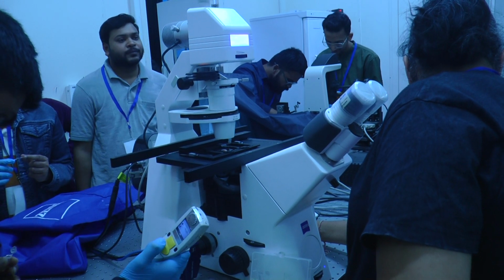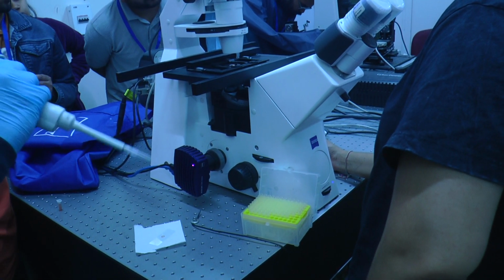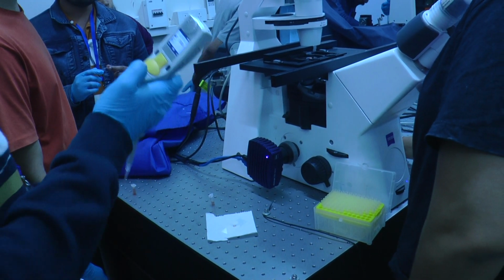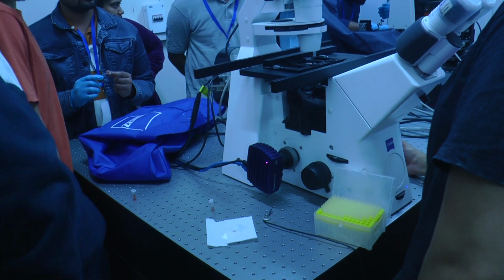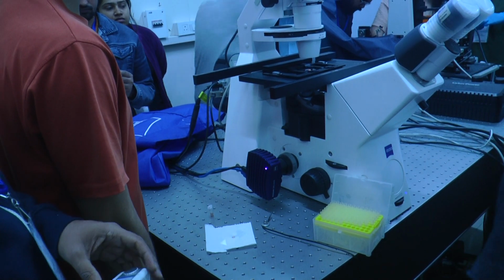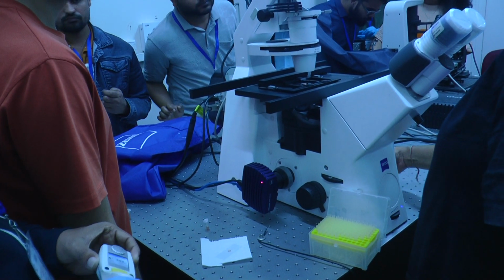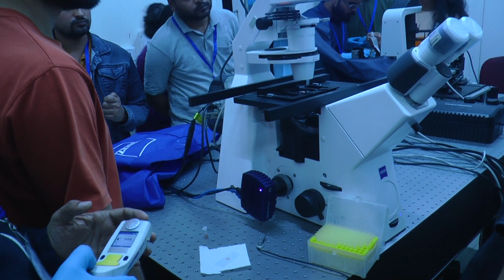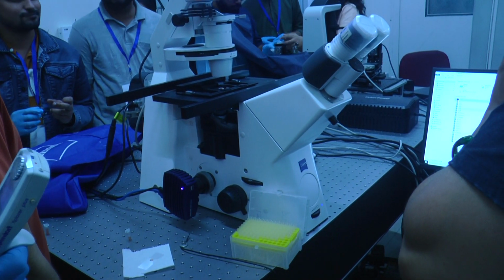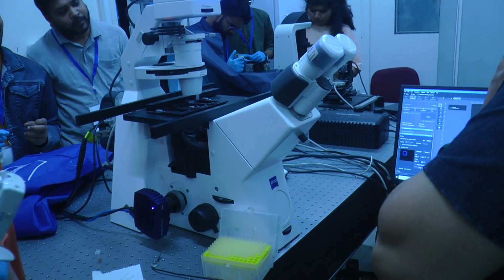Okay. So I've done some kind of damage to the cells. Yeah, this is highly possible because I played with them a number of times. Oh, okay. It's okay. See, usually it's supposed to look like this. The front button is to suck and then load, right? Then you release this. Okay, then why the top?